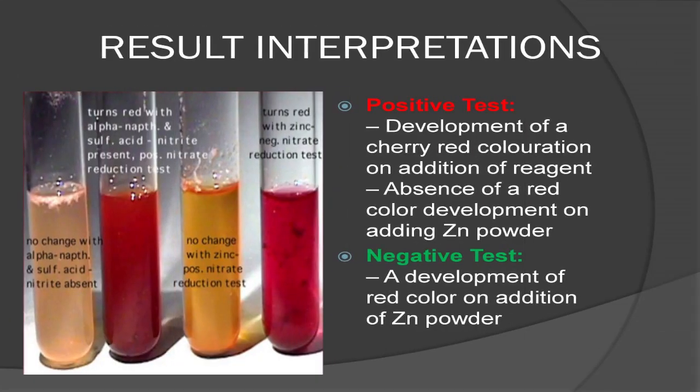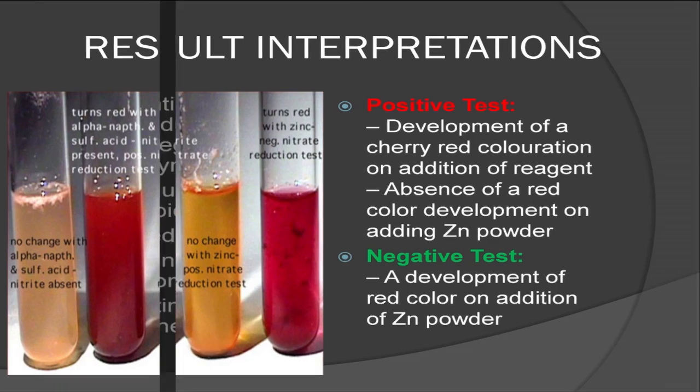Coming to the result interpretation, if it is positive, then there will be development of a cherry red coloration on addition of the reagents, sulfanilic acid and alpha-naphthylamine. And the absence of red color development on addition of zinc powder is also interpreted as a positive test. A negative test will be interpreted if there is development of red color on addition of zinc powder.